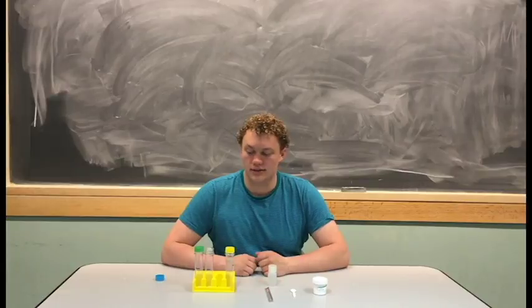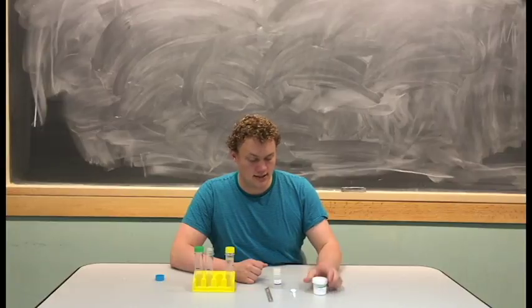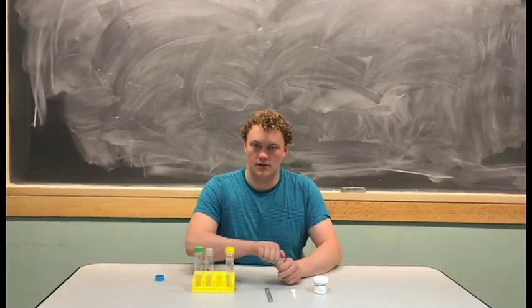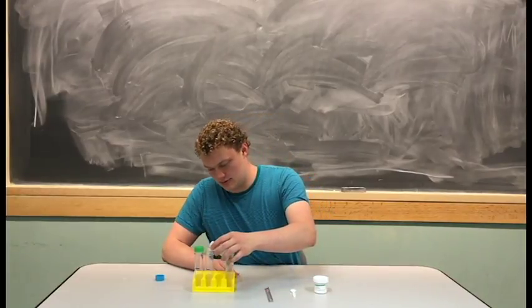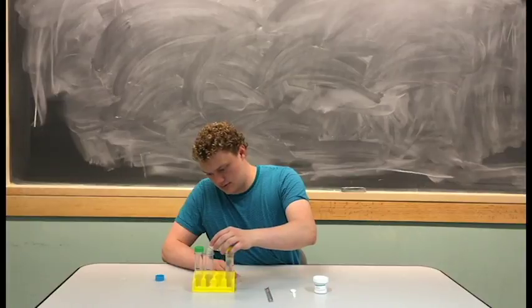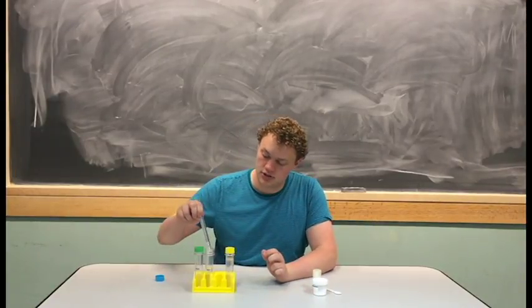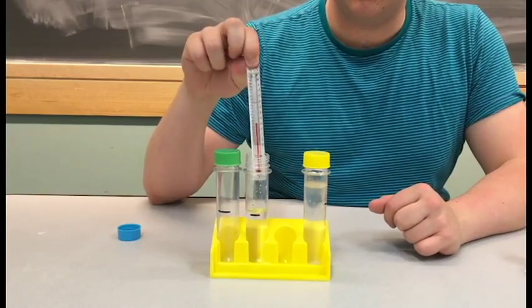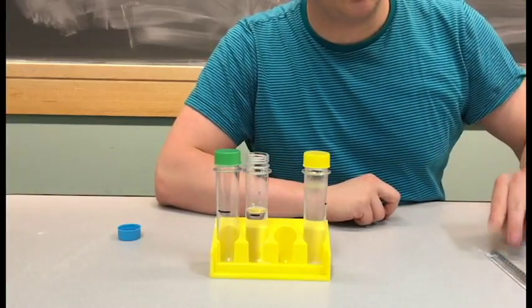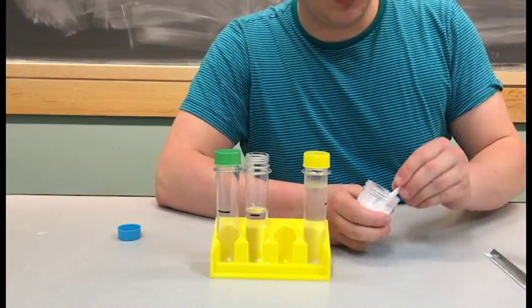All right, go back to the test tubes, and for this experiment, you'll need citric acid and sodium bicarbonate. Pour the citric acid into the test tube up to the line. All right. Then take the temperature of the citric acid with the thermometer. Have the students record the temperature of the citric acid on their observation sheets, and then add 1 spoonful of sodium bicarbonate.